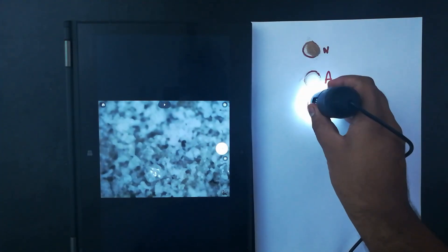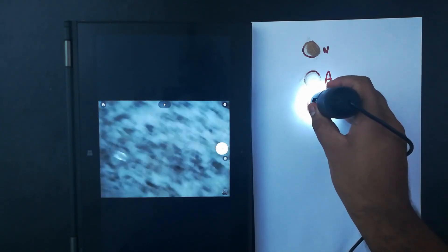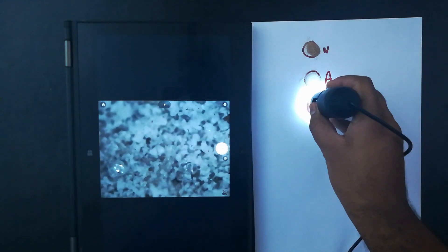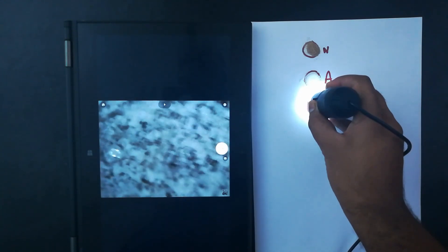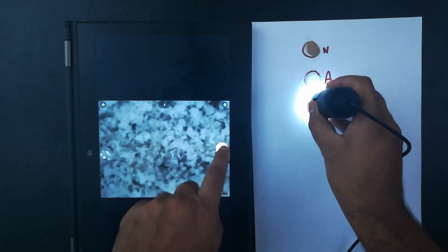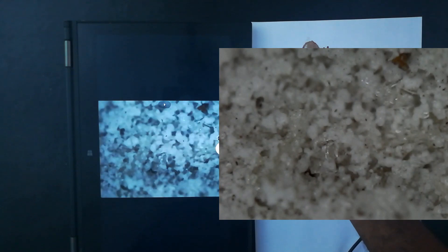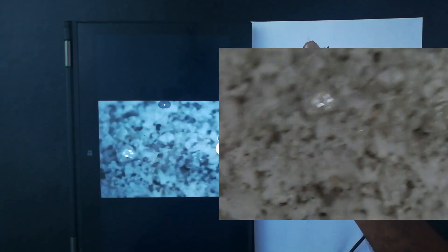Now we're looking at the Muscle Blaze Beginner's Whey. And we're starting to see different things in here. I'll try to do a different type of focus. But to begin with, I'll try to put the markers on the screen. But I think what you can see is there are some plasticky or something. I'm not sure. It's not plastic perhaps. There are certain things which are reflecting light more than the others.